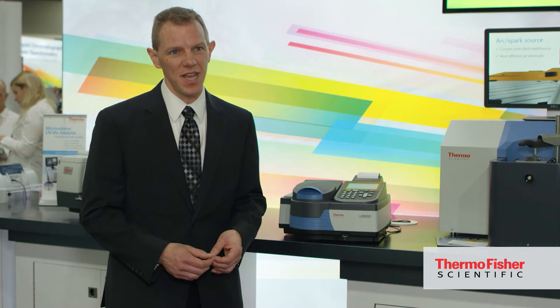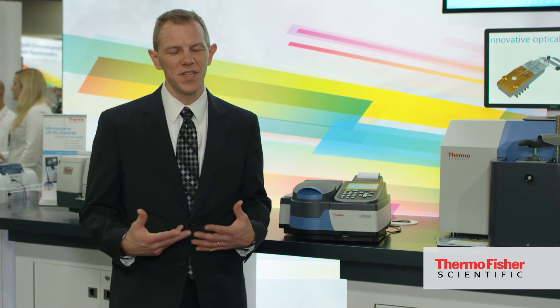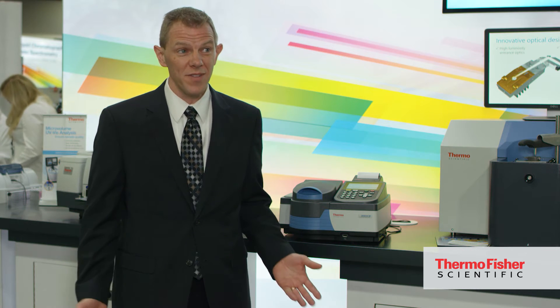It has the Genesis name, so that means it's rugged, it's reliable, it's robust. It's designed to be beat up by students and by lab technicians alike and still continue to work for even decades.